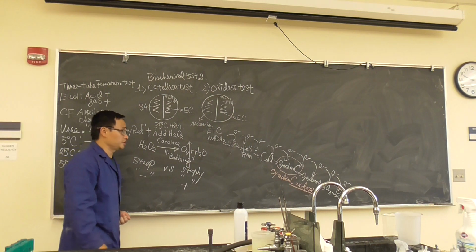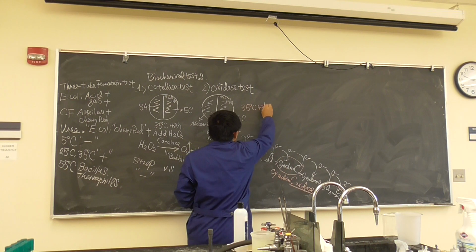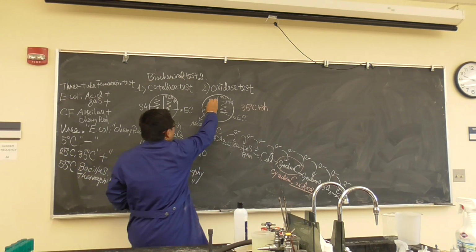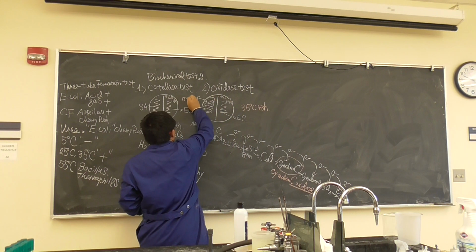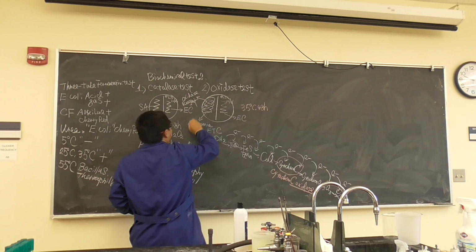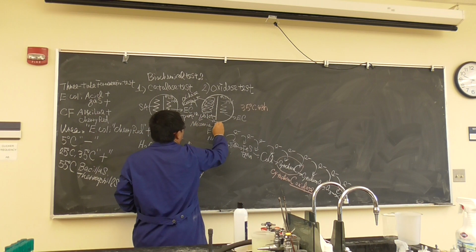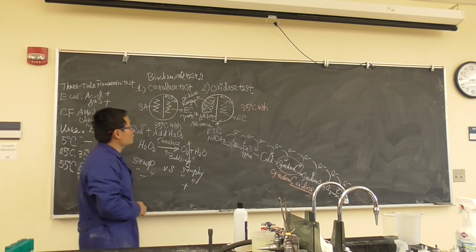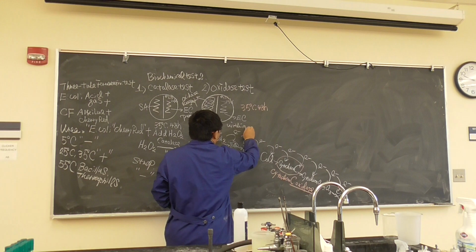And how do we know it is positive? After 35 degrees Celsius, 48 hours, we will add oxidase reagent. You don't have to know which one that is, okay? That is called oxidase reagent, a very long name. If it shows purple color, it is positive. Other than that, it's negative. But always remember, the oxidase test you have to read within a minute.